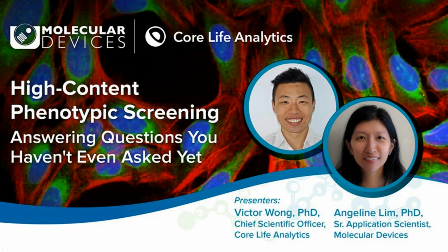Right. And Victor, Renan, do you have more to add? Yeah, I want to add to that in regard to getting started with high content approaches. When I was a postdoc before joining Core Life Analytics, I was involved in starting up this whole process of a high-content phenotypic screening approach to find compounds of interest for neuroscience. And I must say the learning curve can be quite steep, but as long as you have the concept and the foundation in terms of knowing which markers to use and how to validate and optimize your assays.